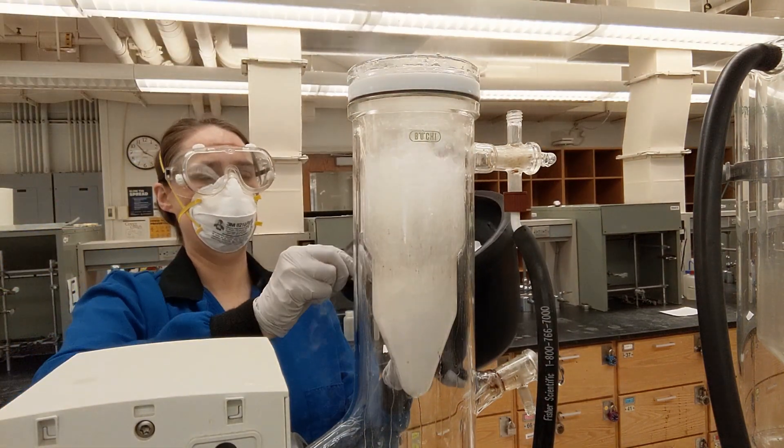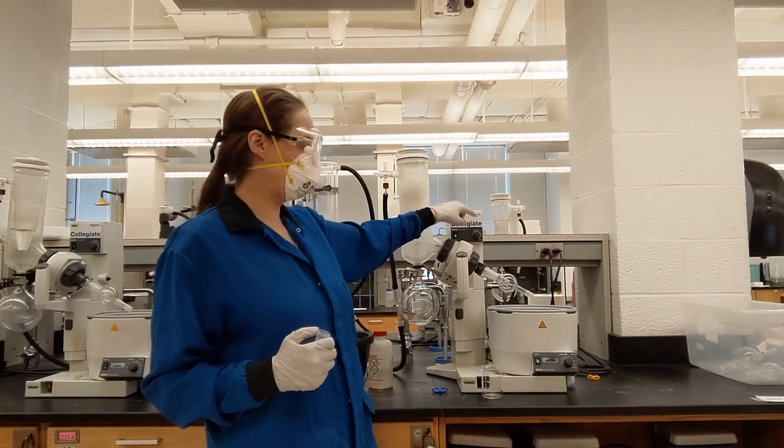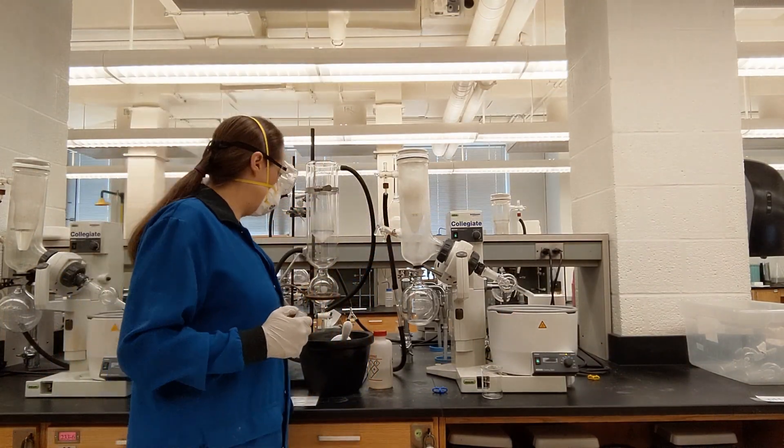There are a few other things that need to be turned on in this particular model. You need to turn on the ability to rotate, and you need to turn on the vacuum pump.